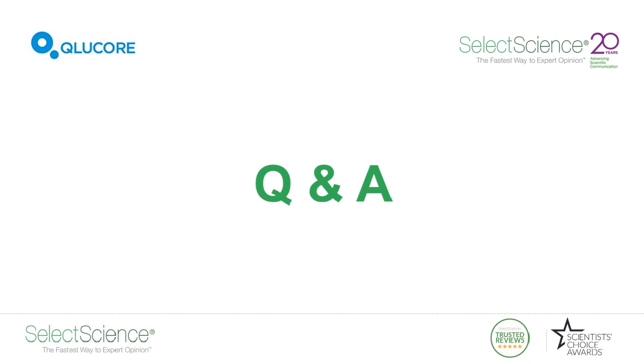Okay, that's a good question, and I didn't show the NGS module. The NGS module is built up by several components. There is one, which is, you can say, a generic genome browser, but what is unique with that is it's coupled with dynamic filters on genomic entities in the same way as you saw me use the filters early on, variance sliding and so on.